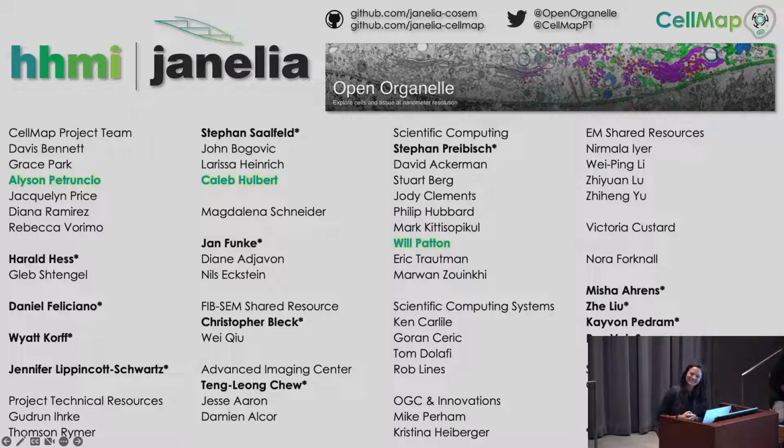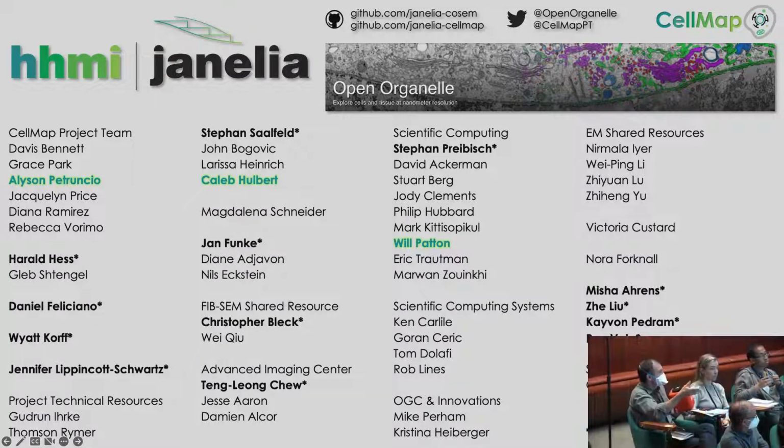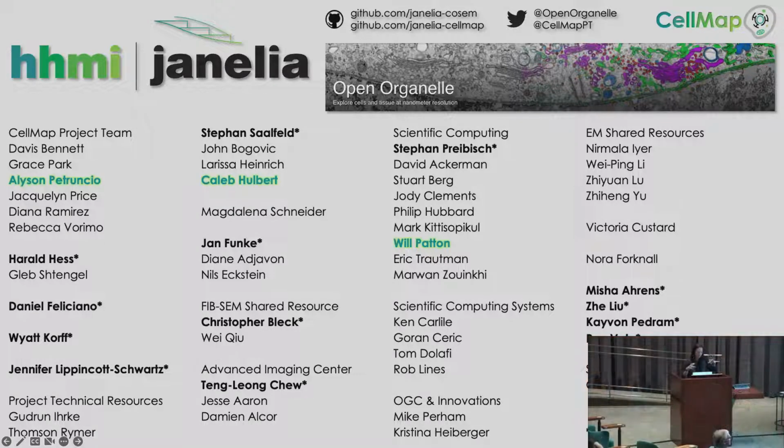It's super cool. I'm curious, when you train these models on one data set, say you capture another HeLa cell, how transferable is it? And similarly, is it transferable from a HeLa cell to, say, a Jurkat cell? Within the first project that I showed you, we actually had 5 different cells.